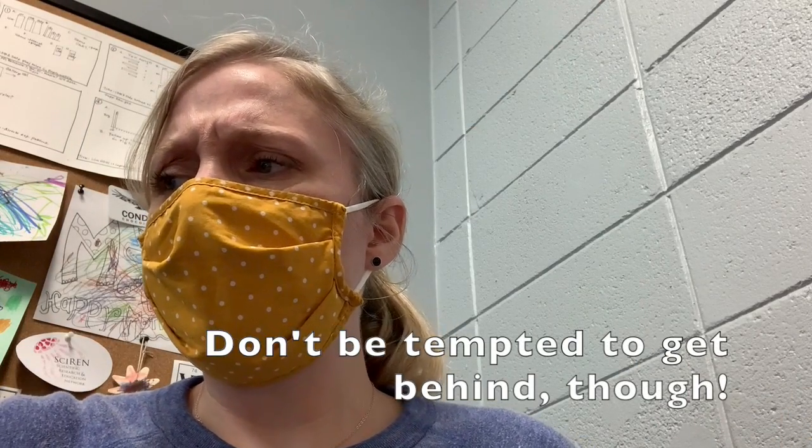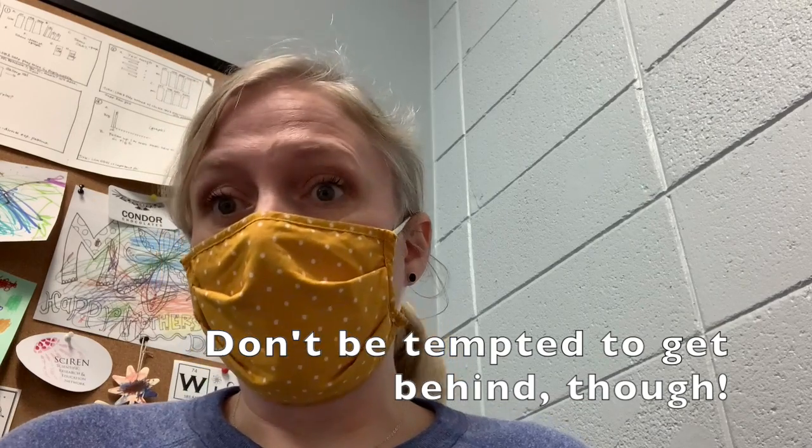It's a little bit hard to write everything down as you're working, or sometimes I'll write things down prior to doing an experiment and then fill in the blanks of how long things take. Either one of those is okay, as long as in the end you have a record of exactly what you did in enough information that someone could easily repeat what you did. Okay, so that's part one, which is keeping a lab notebook.